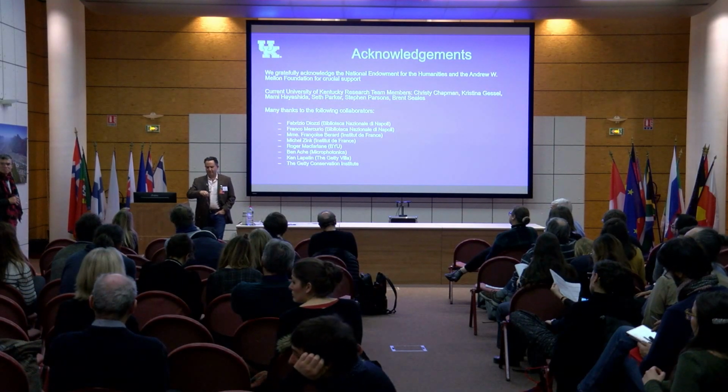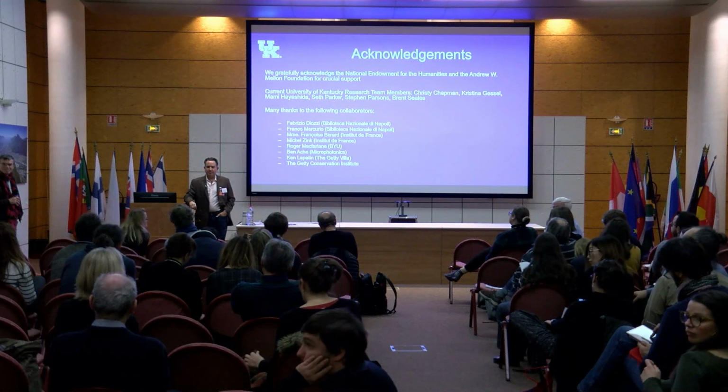So typically, if you can have more information, whatever it is, you will have better results. So did you already try to make, for instance, multiple energy scans? You make the same scan several times and change the spectrum a bit, because you will have more information to give to your system. Yes, we did that a couple of years ago.